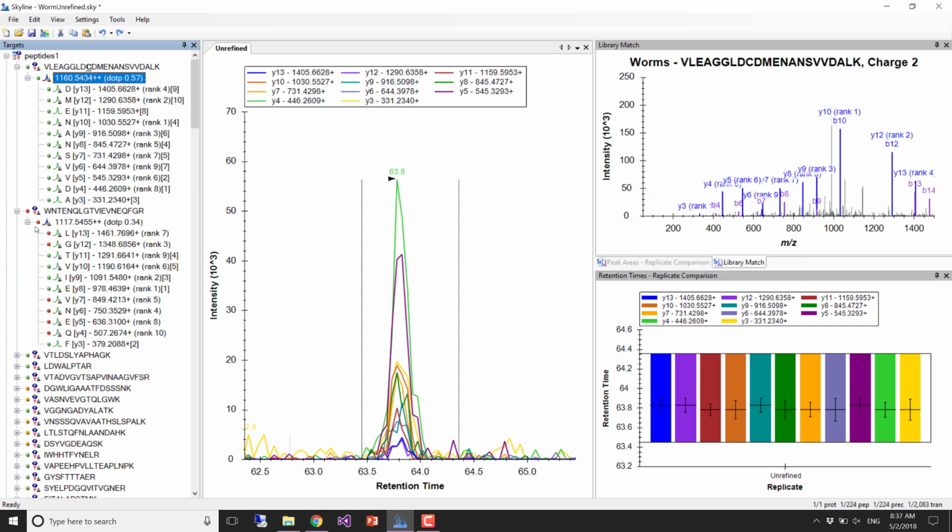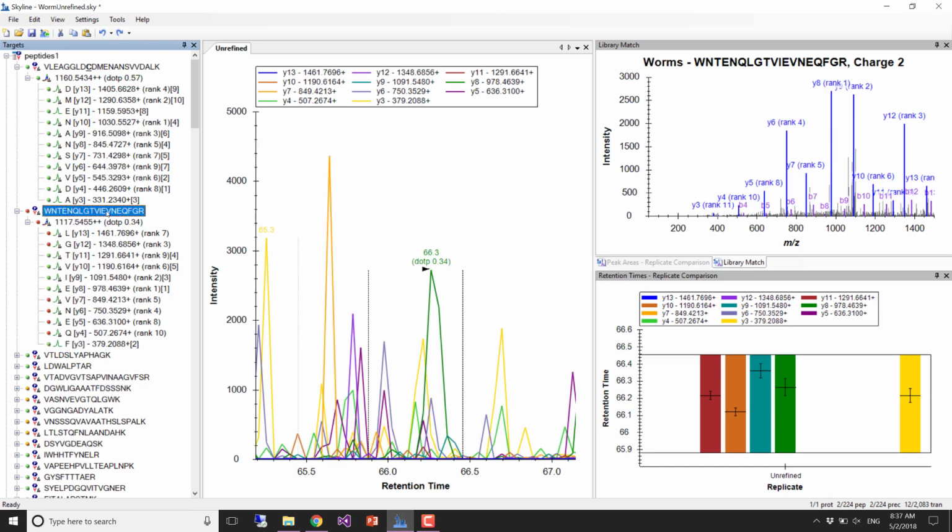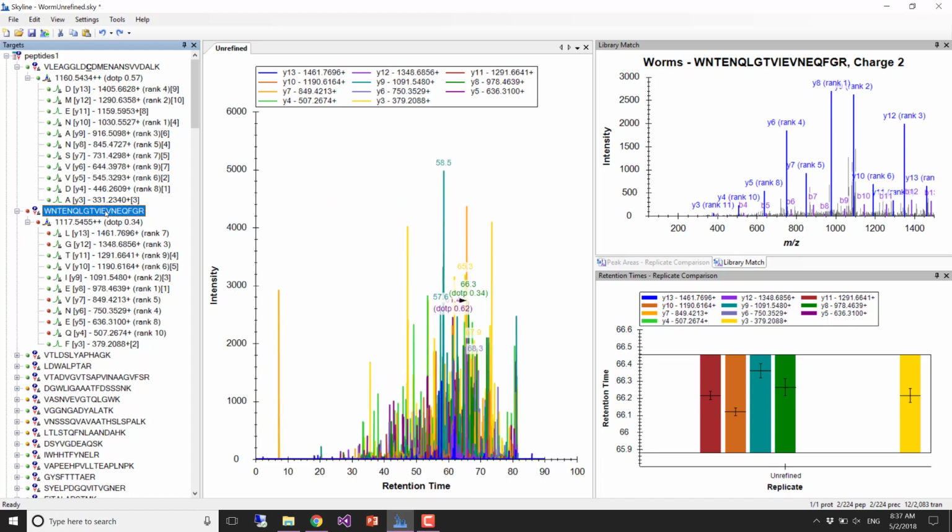And these spectra were collected on completely different instruments, an LTQ versus a triple quad. So next, let's move to the next thing. Here again, I think we probably decide there's just not anything. The highest intensity thing we see is 5,000, and we can zoom.